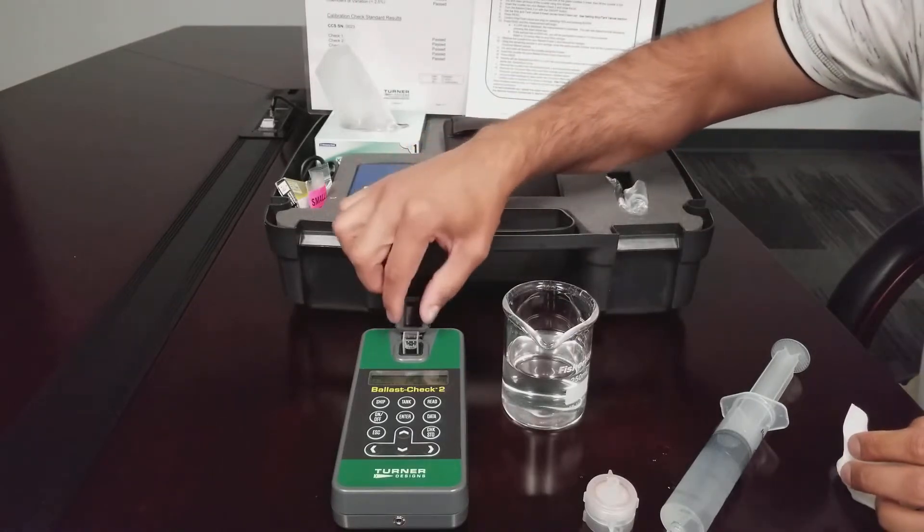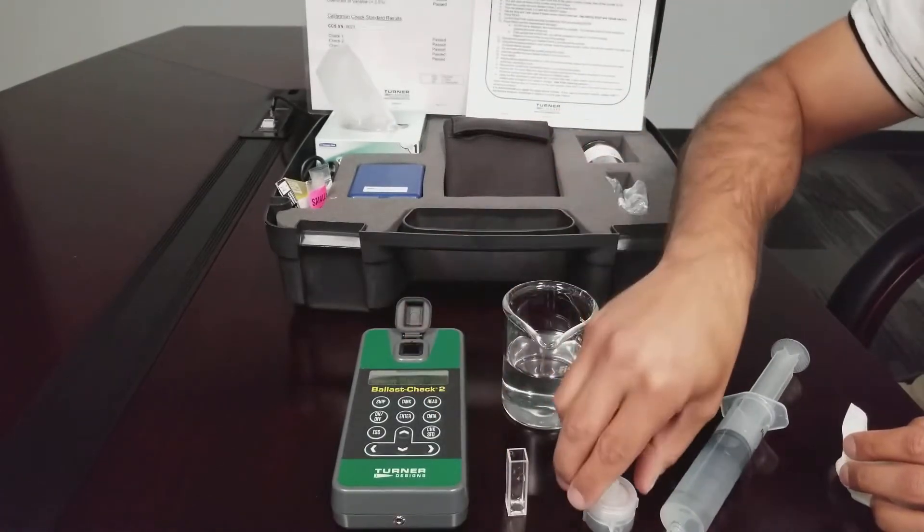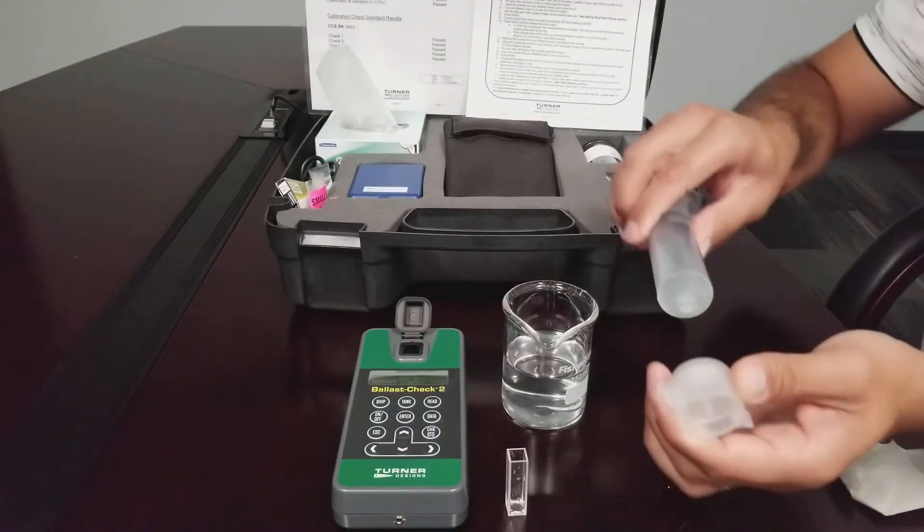Remove the cuvette from the instrument and discard the sample. Obtain a 10 micron filter and attach it to the end of the syringe.